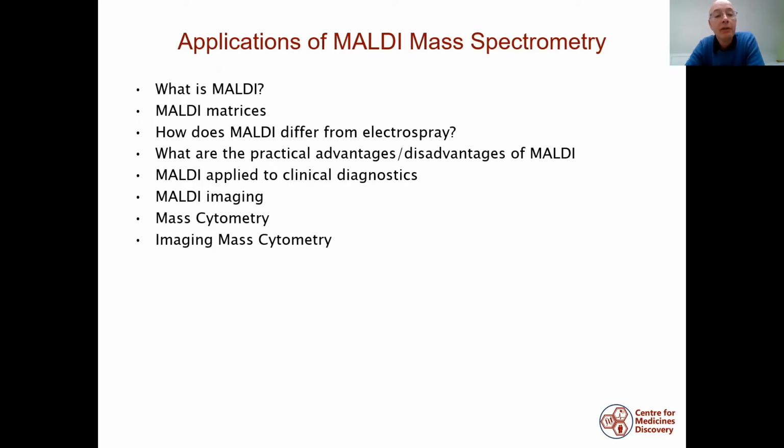I'm then going to focus on three different techniques. Firstly, MALDI applied to clinical diagnostics, which I think is extremely interesting. MALDI applied to imaging, and two different imaging technologies. One is mass cytometry, and the other is imaging mass cytometry.